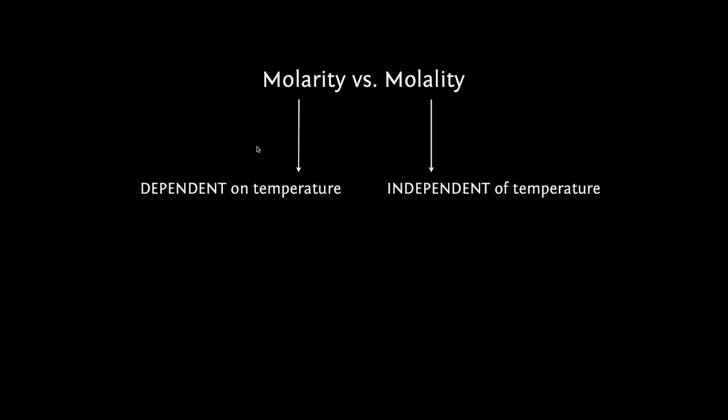So we're going to be reviewing what we have learned throughout this lab. The first thing that we have learned is the difference between molarity and molality. Molarity is dependent on temperature, while molality is independent of temperature. That is why we use molality for this lab.